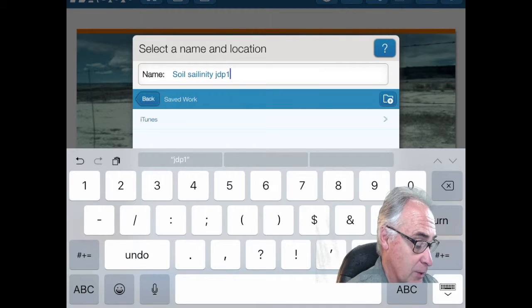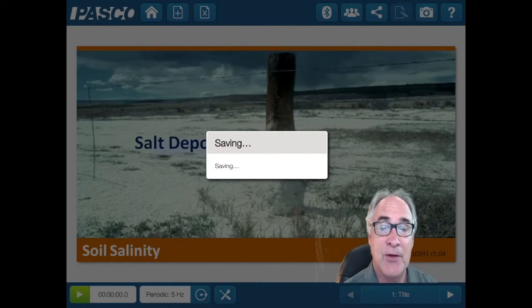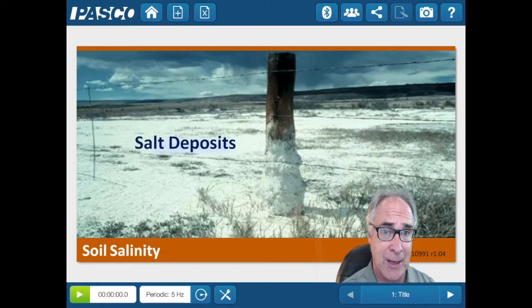So now what I'm going to do is press OK, and now I have a unique name that's just for me. Now, so long as I have this particular iPad, I can work on it day after day after day. Sometimes these labs will take more than just one period or one day to do. So what I would suggest is give yourself a unique name for the file or the lab, and then put your first name and last initial, or first initial and last name, or something like that, so you can find it right away.